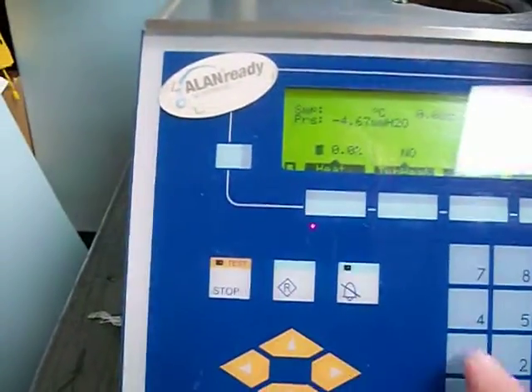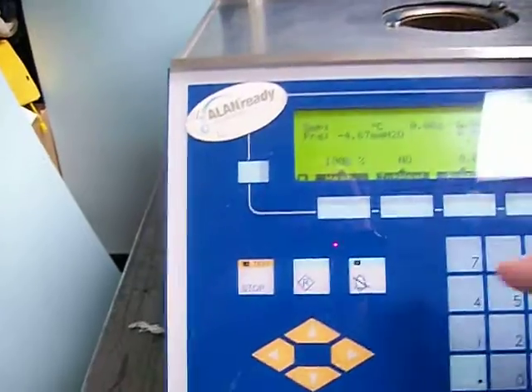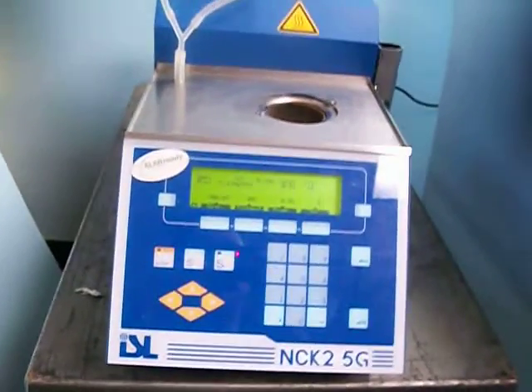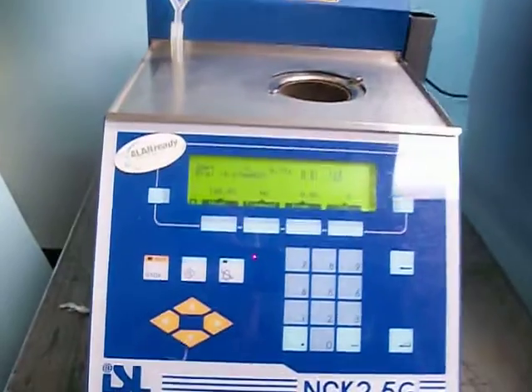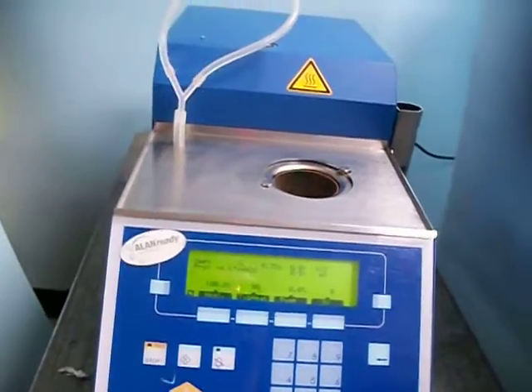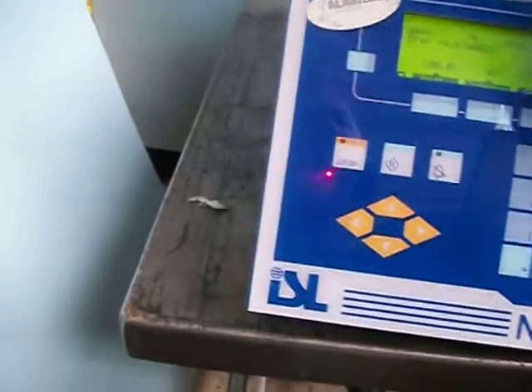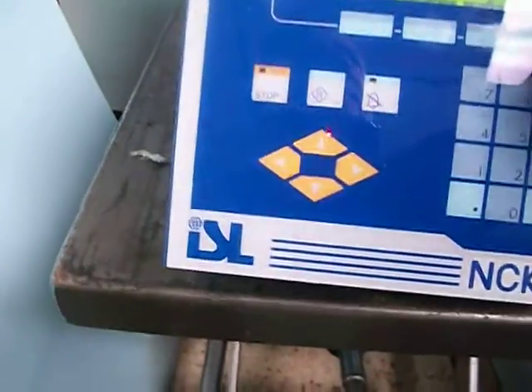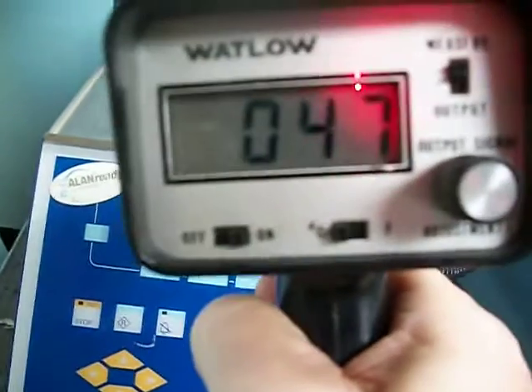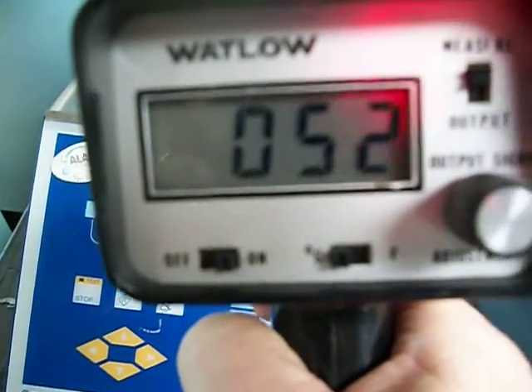Let's put the heat on and show that the heat is working. Let's get an overall of the whole machine. As you can see, it is heating up.